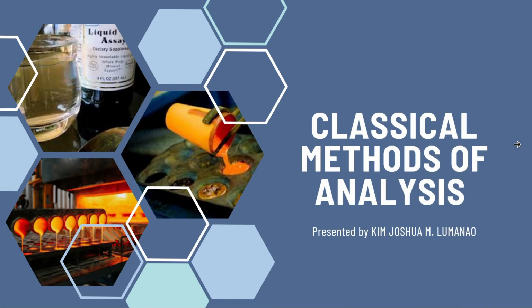Good day, sir. Today I will be presenting the classical methods of analysis and the techniques of metallurgical analysis. These methods are among the oldest, but still are very important techniques in determining the quantity of metals in ores and samples. Classical methods of analysis are techniques used before modern instrumental methods were developed.